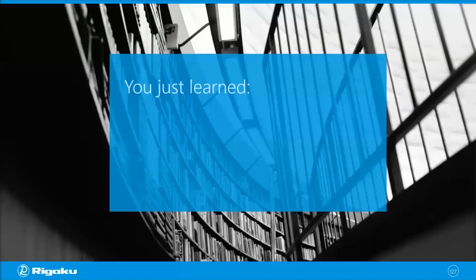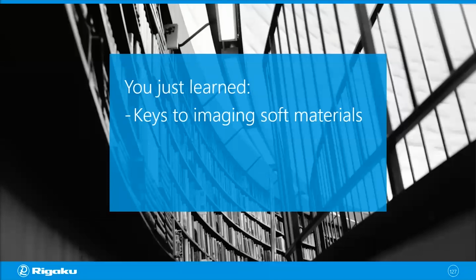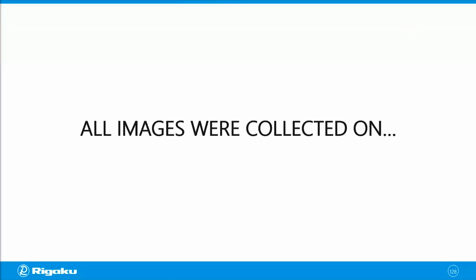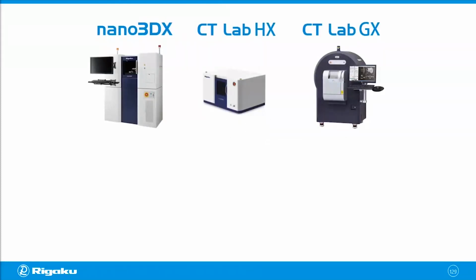So you just learned some keys to imaging soft materials. And we looked at food science applications and pharmaceutical applications. All the images you saw today were collected on the Rigaku X-ray CT scanners.